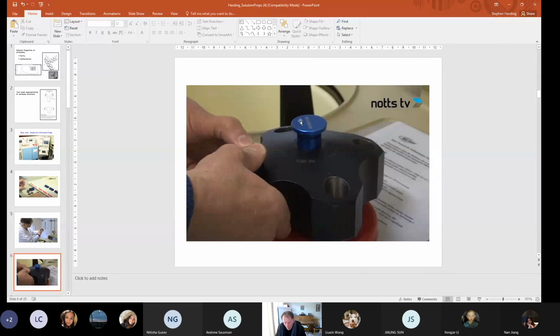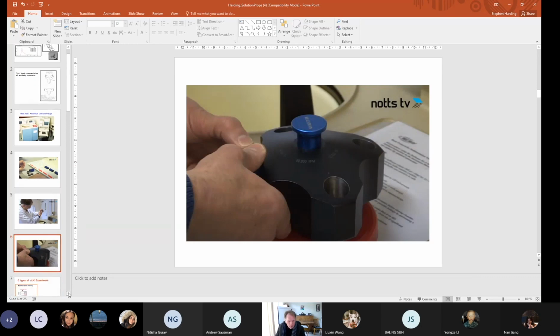So very high speeds, up to 60,000 revolutions per minute. And when it's spinning this way, you get very large centrifugal fields coming out from the center, as much as 200,000 G. But these high G forces, very small particles like proteins, antibodies, and other types of molecules will sediment.